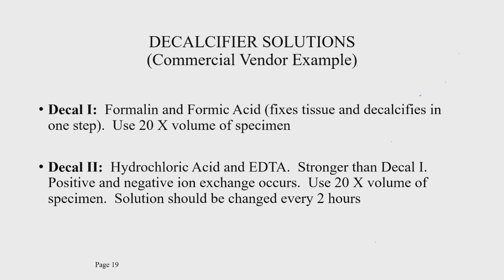which is a carcinogen. If you're working with this and you haven't rinsed it, you're going to start breathing these vapors, and it's very caustic and very dangerous for you to be breathing that. So you want to rinse that out very thoroughly before you put it into formalin or the tissue processor. So, bischloromethyl ether: very important to rinse if you're using HCl or any kind, but particularly HCl. Rinse that specimen thoroughly before you move on after the decalcifying process.